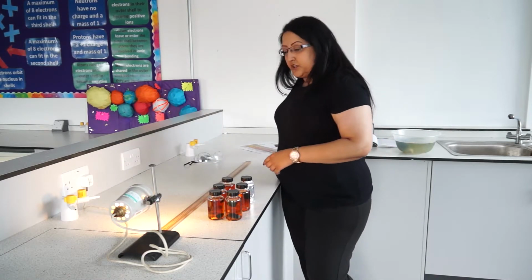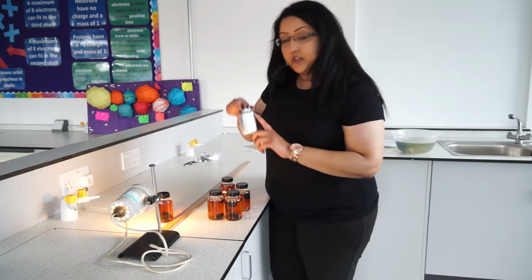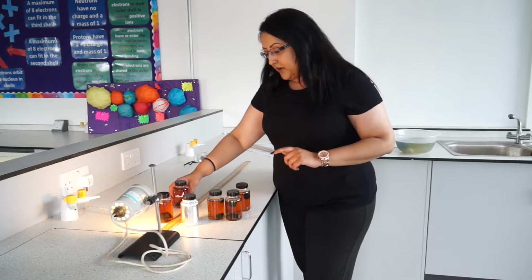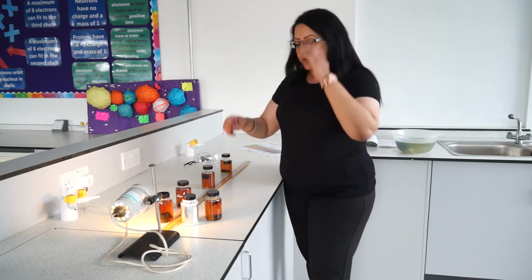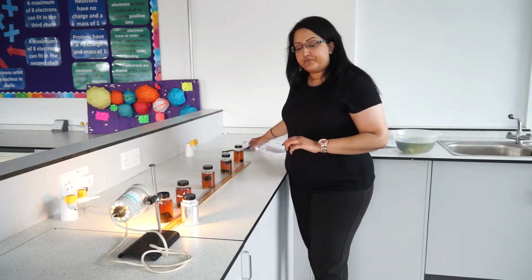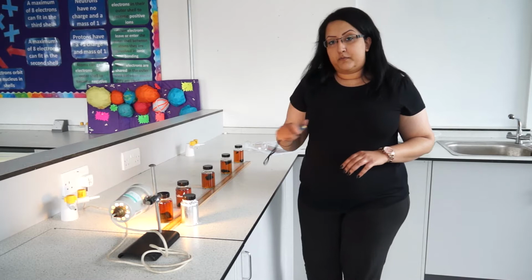So you put one at 10 centimetres, and the control one you put in line with it. You put one at 25 centimetres, one 50 centimetres away, one 75 centimetres away, and one a metre away. And then, once you've done that, you press start on your stop clock.